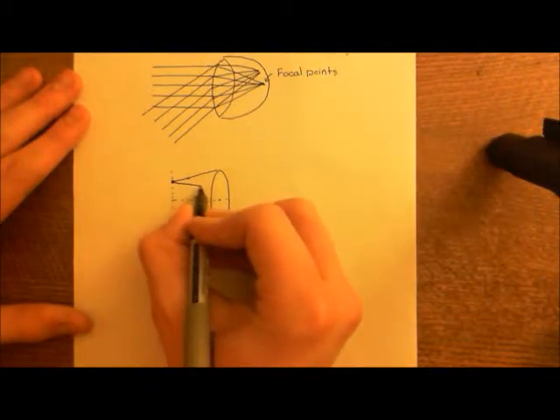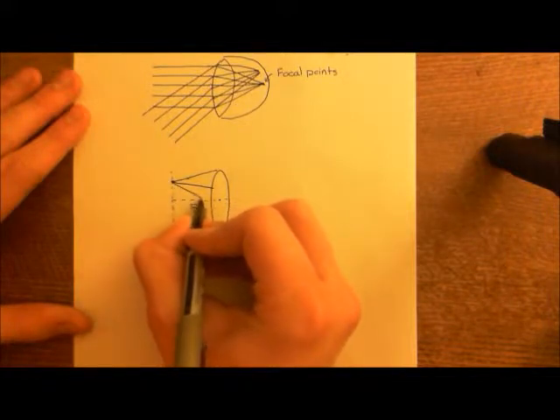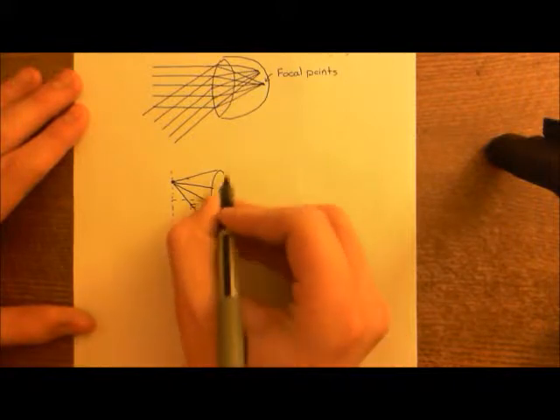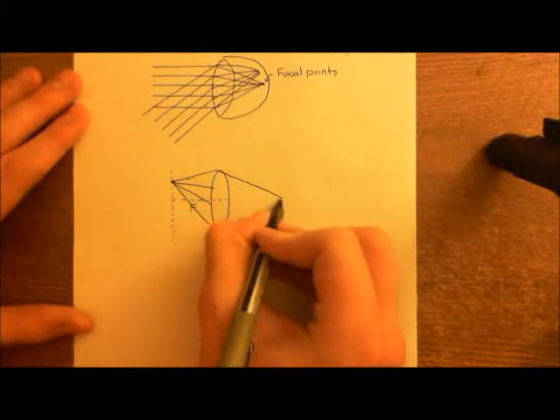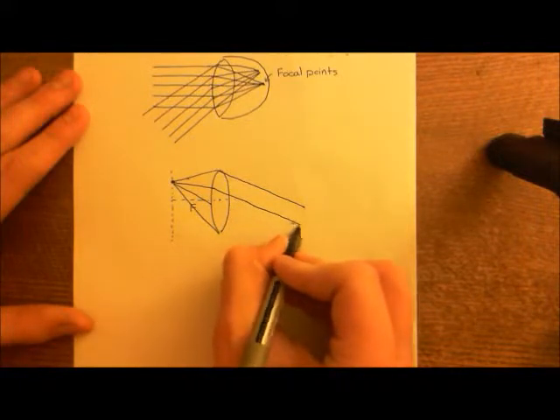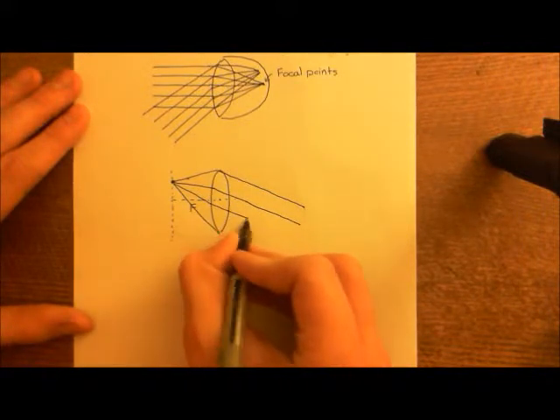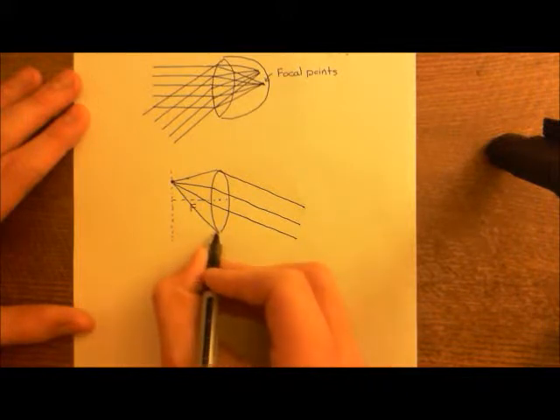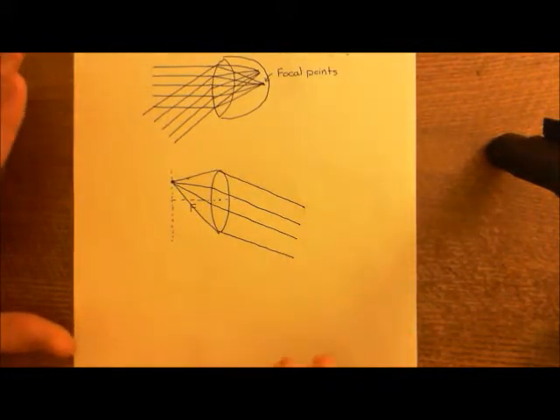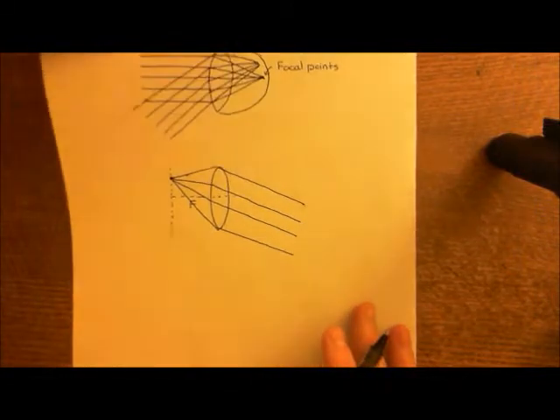So let me show this happening. Okay, so imagine all these light beams rocketing towards our lens here. And now they're all going to come out parallel, like so. But they're no longer horizontal, they're going off in this direction here. And hopefully you might now start to see how this compound microscope is going to all click together.